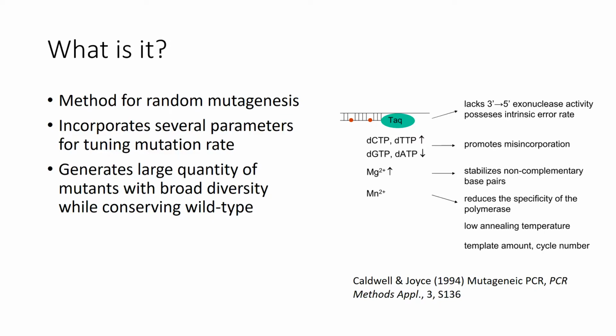Due to the nature of this technique, a large quantity of mutants can be created with relatively broad diversity. As well, due to the presence of the template DNA in our mixture, we can ensure that our wild type is also included in the library.